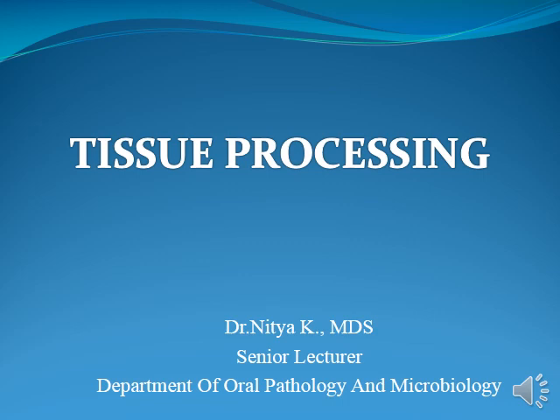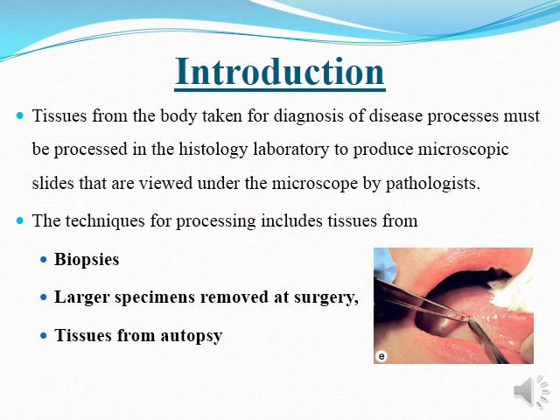Good morning. So today's class will be on tissue processing. Basically, tissues from the body taken for diagnosis of disease processes must be processed in the histology lab to produce microscopic slides that are examined under the microscope by the pathologist.